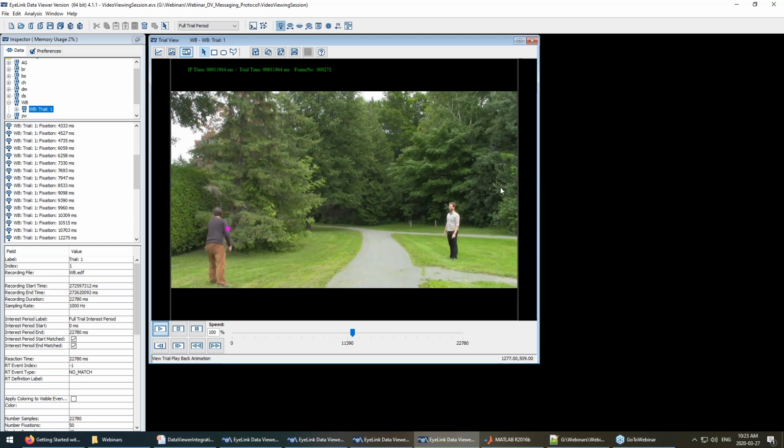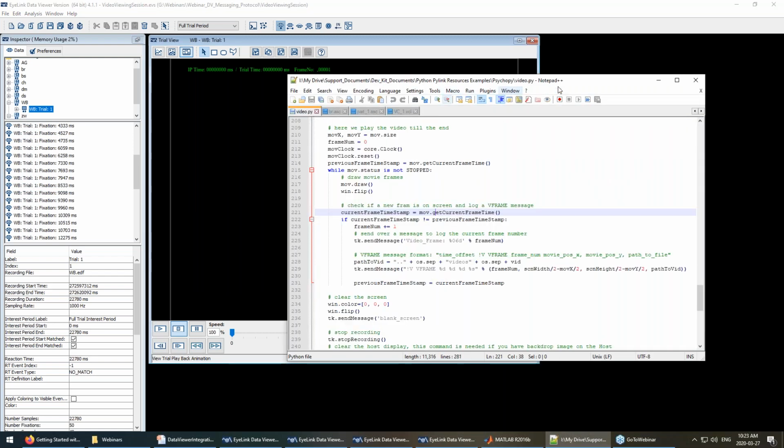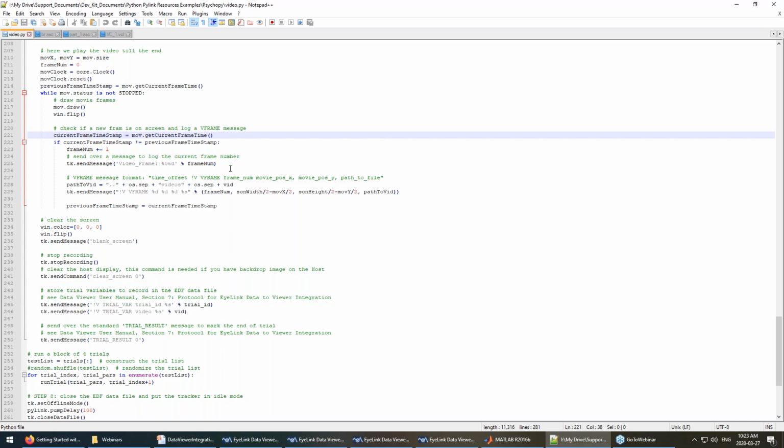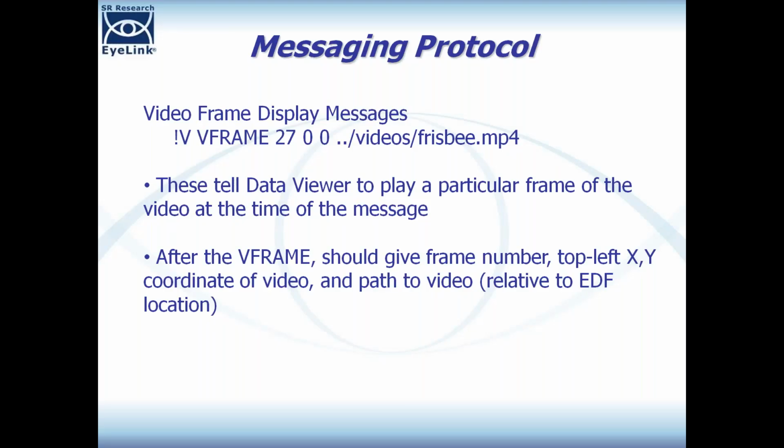Ignore this guy here. That's me. That's my colleague Greg. But basically, you're able to see the video here because of a series of these video frame messages that are sent to the data file. And just as an example, I have a PsychoPy script here that shows how to do video playback in PsychoPy, and you can see it's basically got a loop set up here. And on each frame of the video, it's sending a different frame number, okay? All right, so that's what it will enable us to see, the videos played back in Data Viewer.